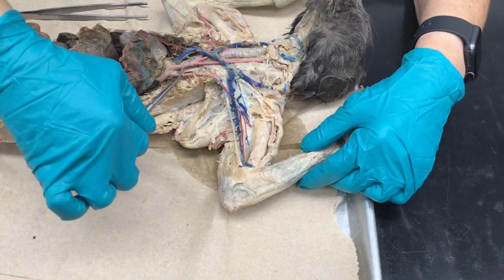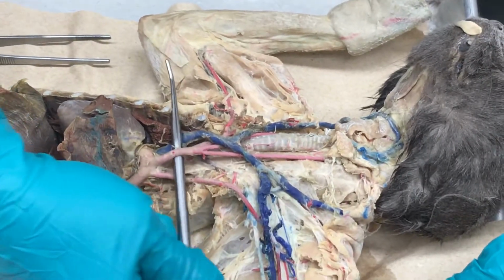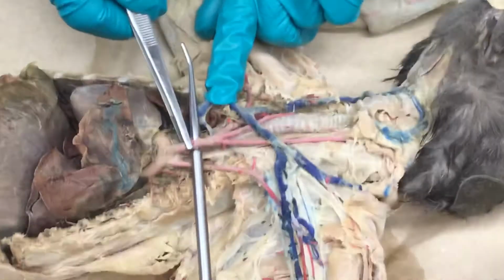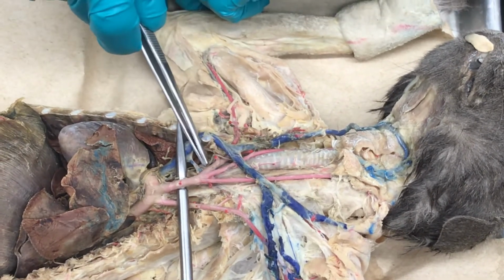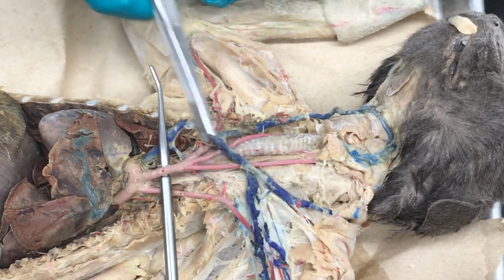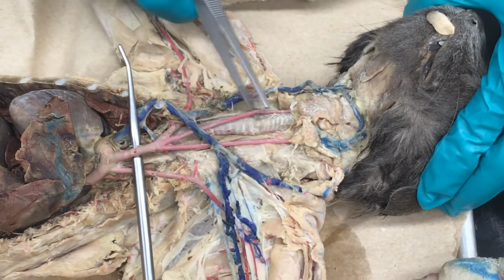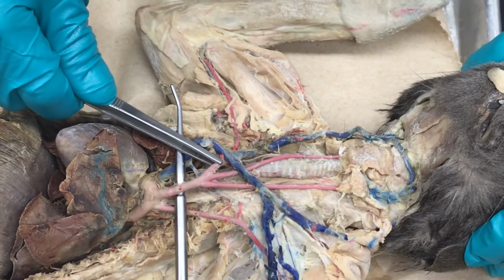Now, the second vessel that comes out of the arch of the aorta is called the brachiocephalic artery. I'm going to take this vein and move it so we can see better. Look how the brachiocephalic artery is going to divide off into three different vessels. Kind of looks like a chicken foot in here. These two are the common carotid arteries. Here's the left common carotid artery. Look how they lie on either side of the trachea. The middle one is the right common carotid artery. And then this third vessel here is the right subclavian artery.